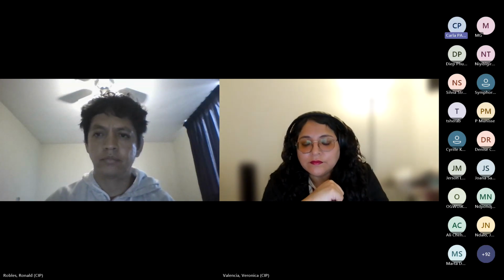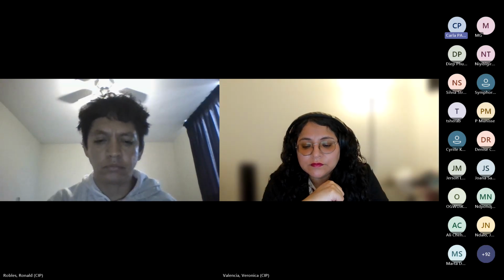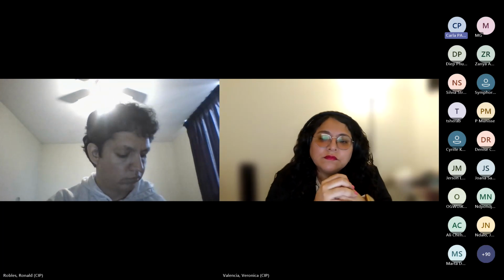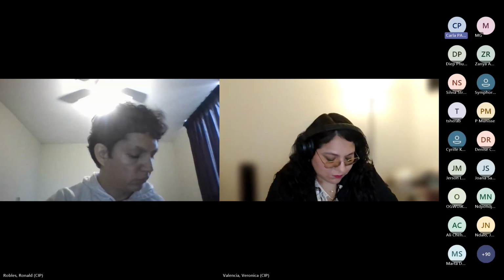I have two questions. One is, do you have any insights regarding fresh samples and storing them directly at -80 degrees for a few days or few weeks before we do the extraction? Because we don't have liquid nitrogen, so when we prepare samples, we just take them from the in vitro tubes and we place them in Eppendorfs at -80.